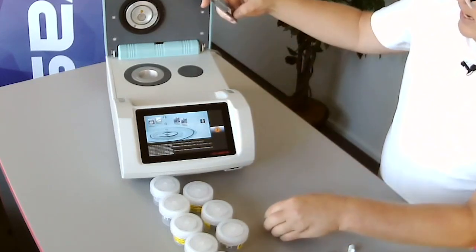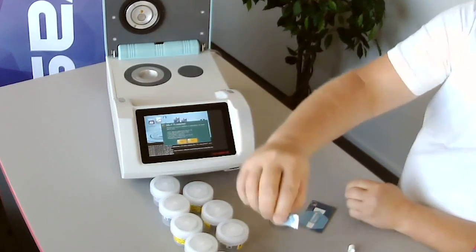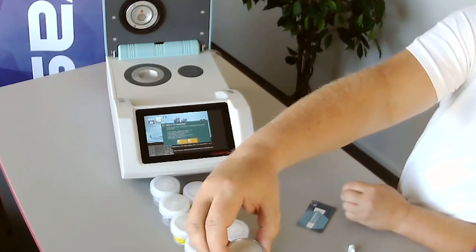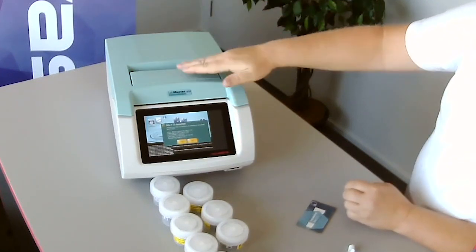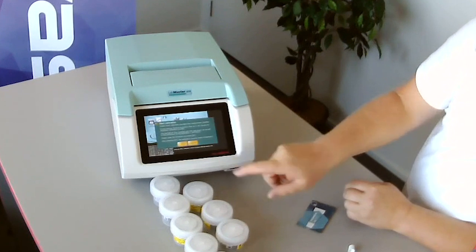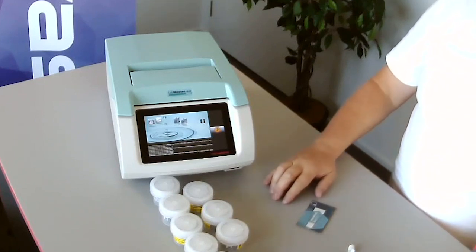Take the card and place it over the RFID chip. It comes up and says '75 detected.' Verify that you are using the 0.75 standard, then take your standard cup, place it in the instrument, close the lid, and answer yes that it's 0.75. It will then ask if you want to start a calibration, and you hit OK. The calibration will run.